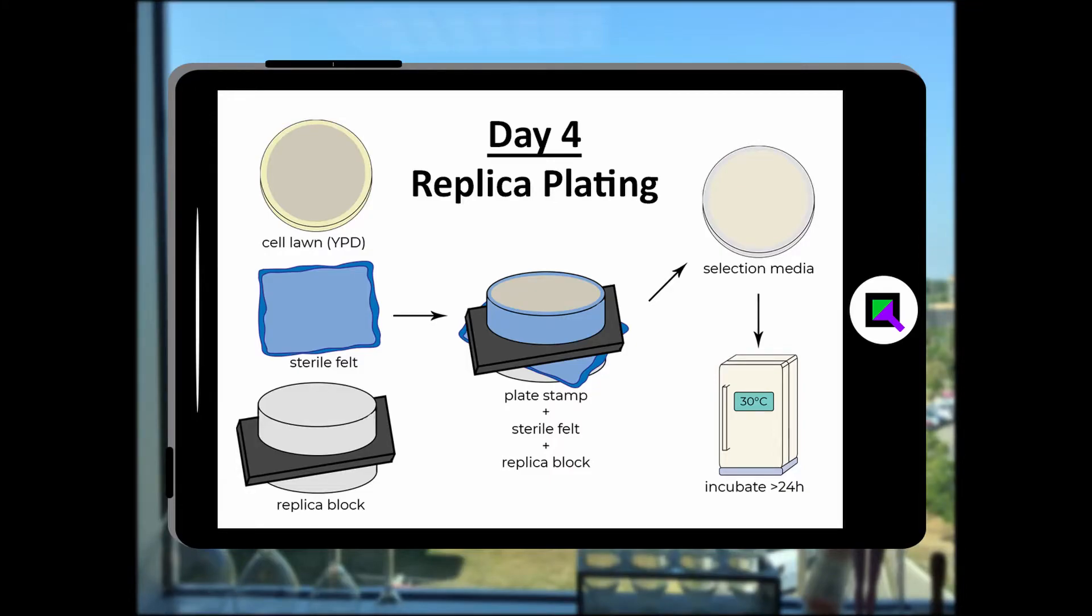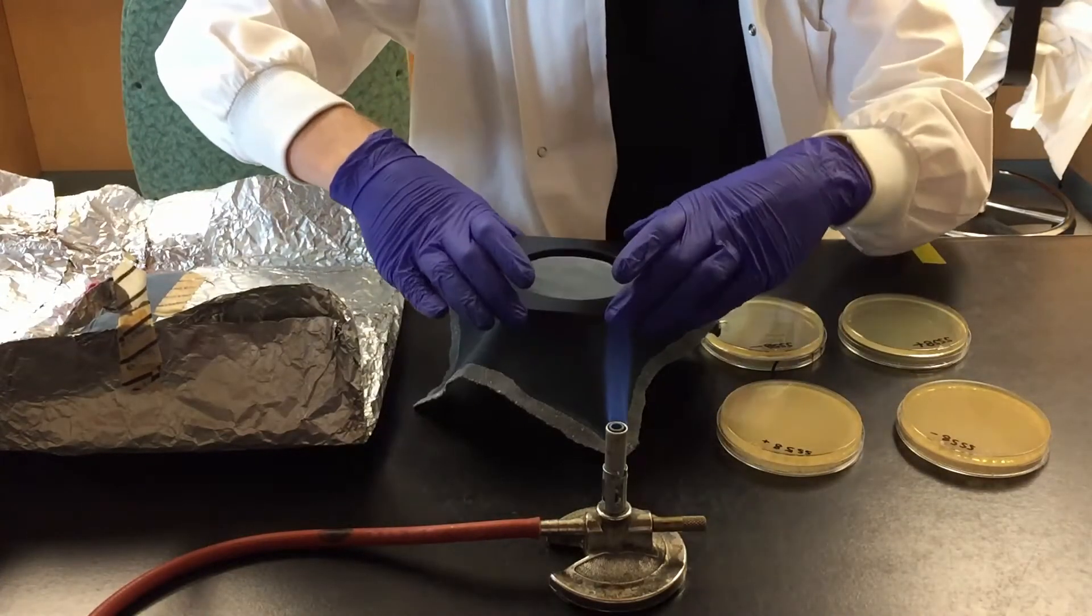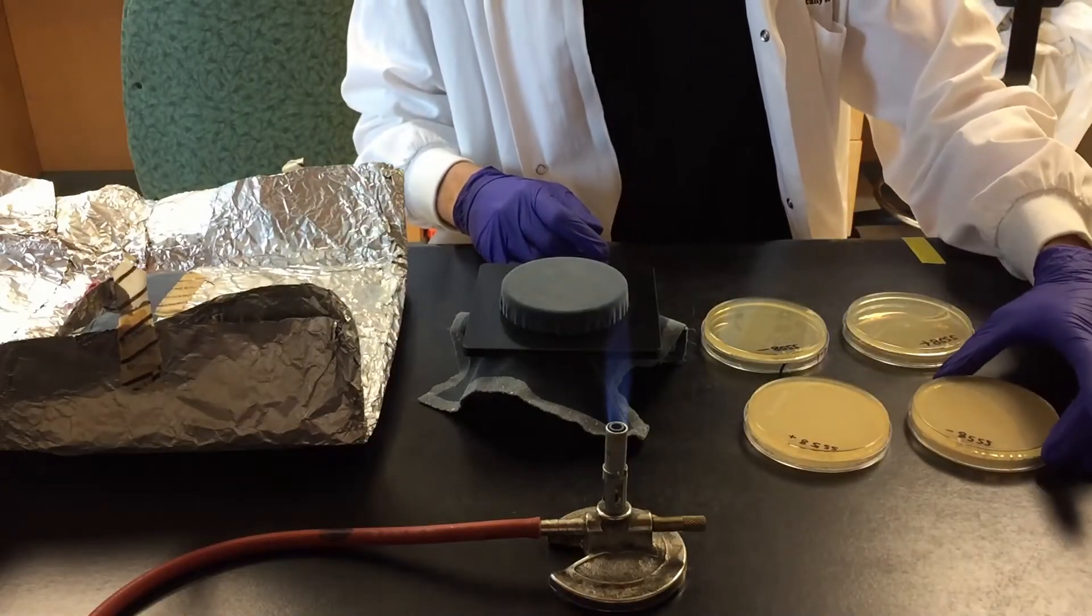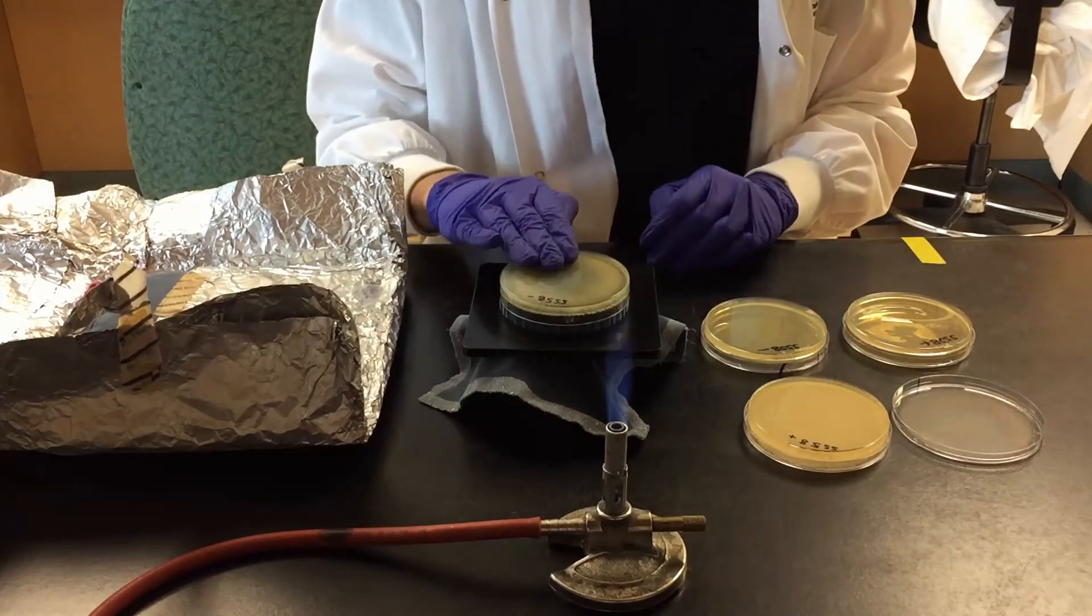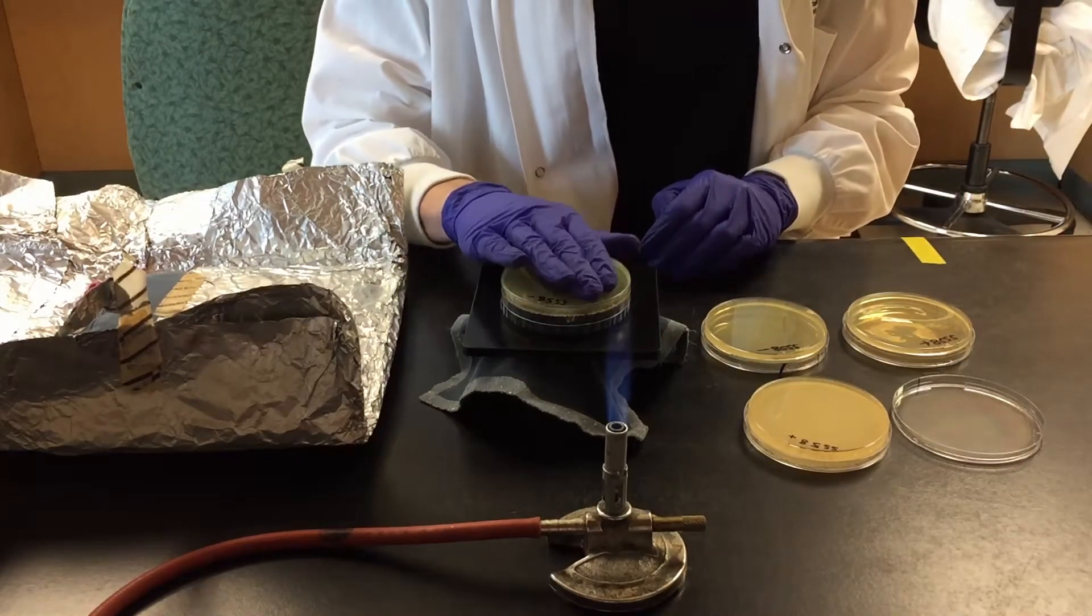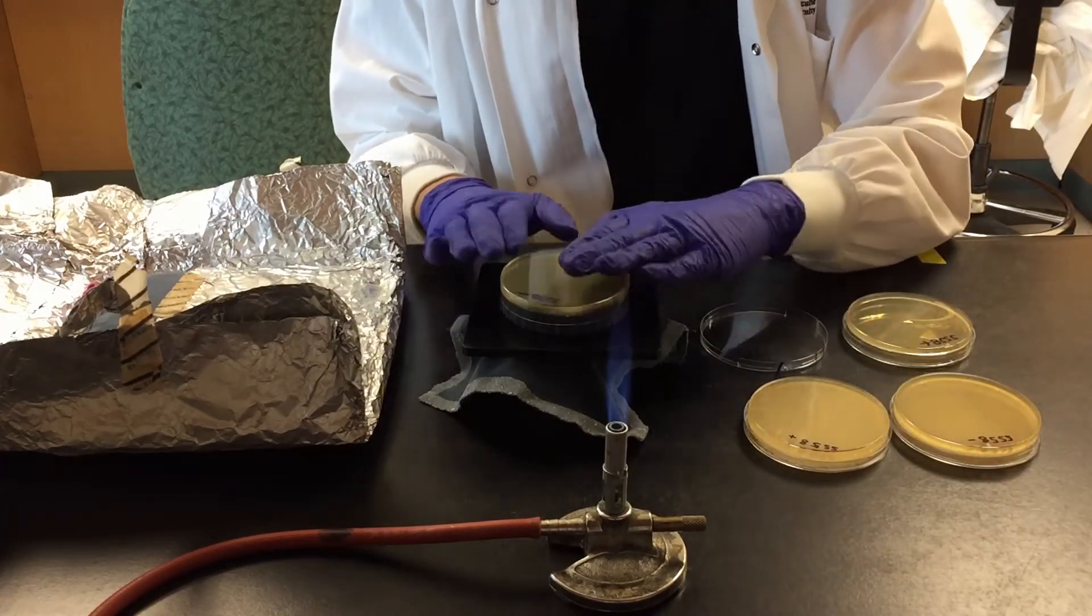Day four, replica plating. Place the sterile felt over the replica block and make a stamp on the felt with the lawn of cells from the transformation. There's no need to apply significant pressure to the plate, just ensure that the agar is making contact with the felt.